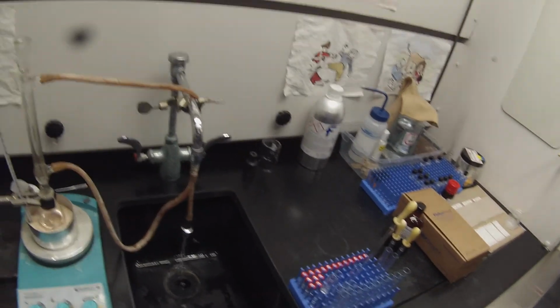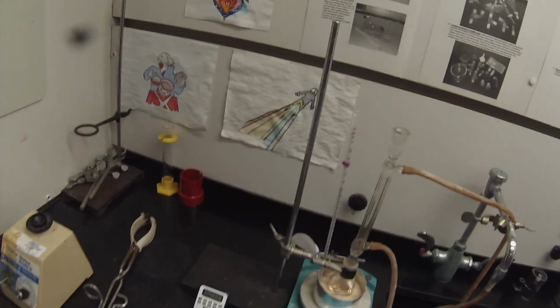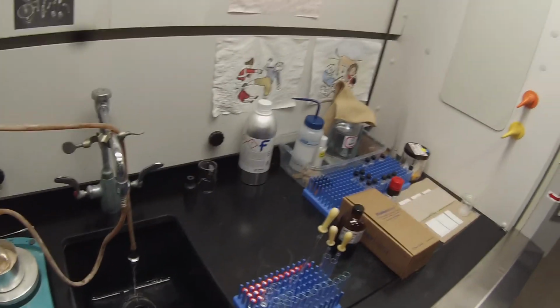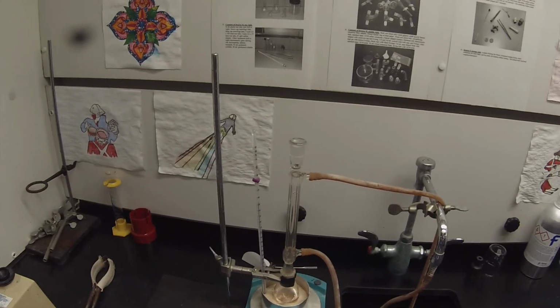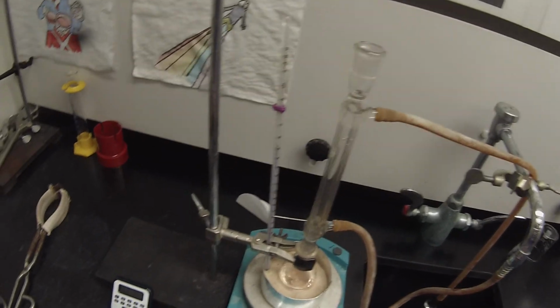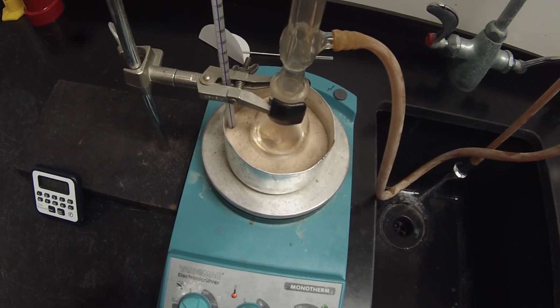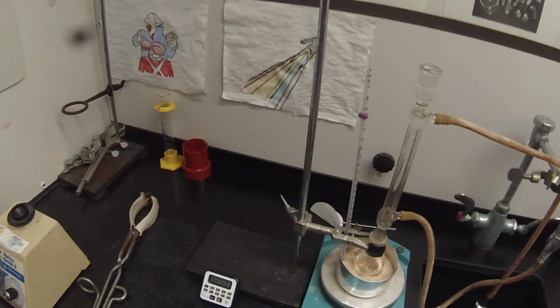In addition to taking out the excess para-toluene sulfonic acid to stop the reaction, this reaction is eliminating water, and so the anhydrous potassium carbonate was also being used to absorb the small amounts of water that are forming in the reaction. You may notice that it's already turning slightly pinkish, and it will continue to turn deeper over time.